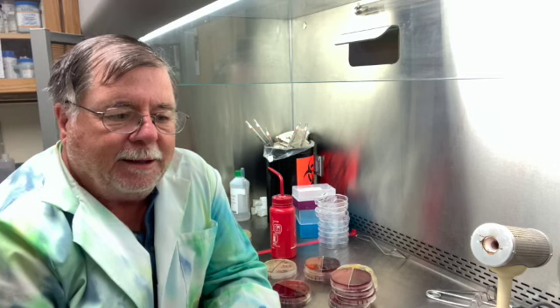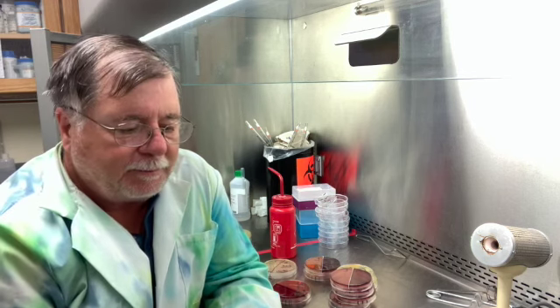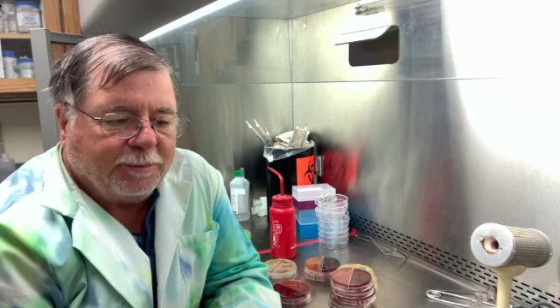Hi class. Today we're going to finish up the eosin methylene blue or EMB agar and MacConkey agar. The MacConkey agar and EMB agar are classified as differential media and selective media. The differential media means that it differentiates between coliform and non-coliform, so bacteria that grow in the gut or the colon or the large intestine, and those that don't grow in that, normally. And so differential media separates those two classes.